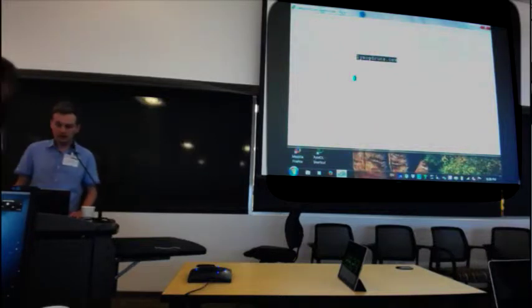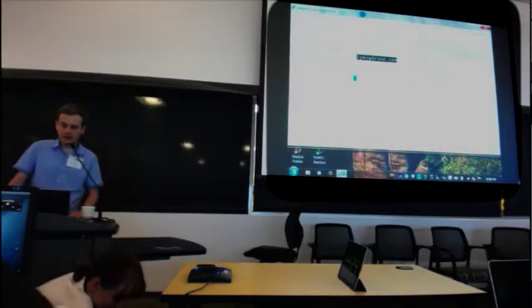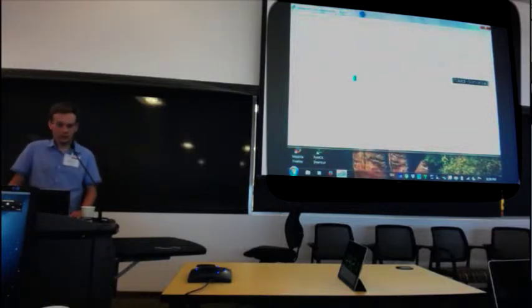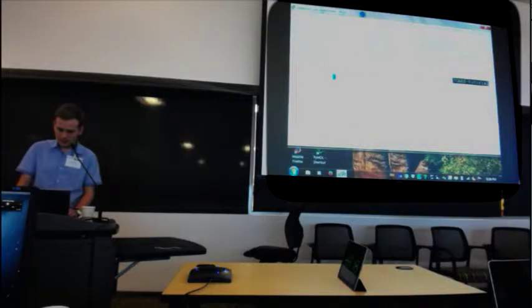In your directory, inside the CASS tutorial directory. So let's go back. In your Scratch directory, you should go to your home directory, the directory with your name. In my case, it's Nass.